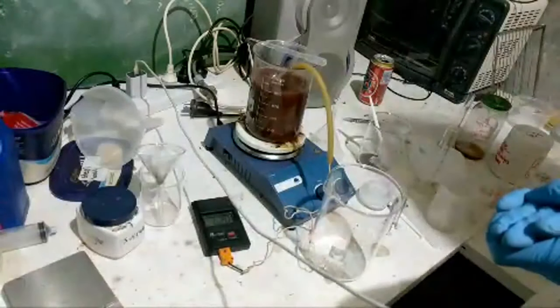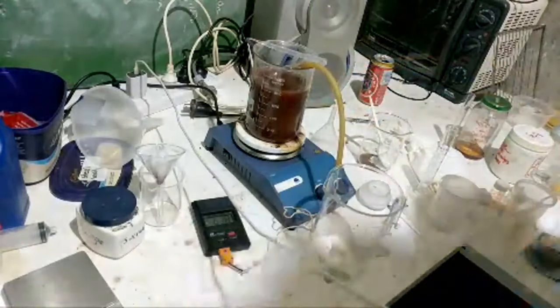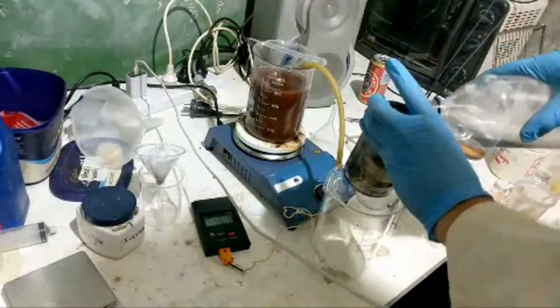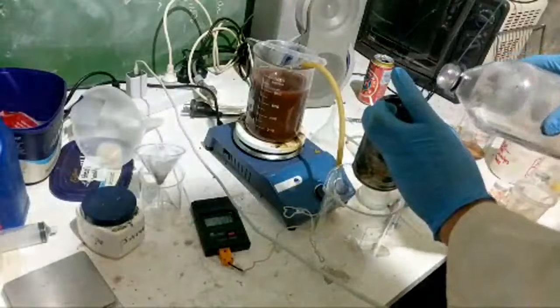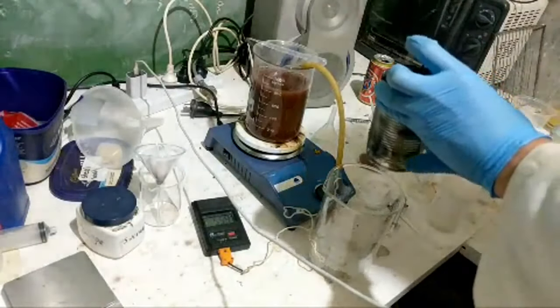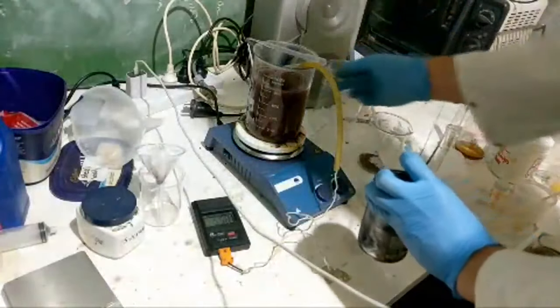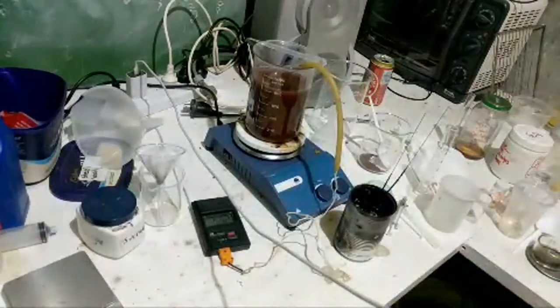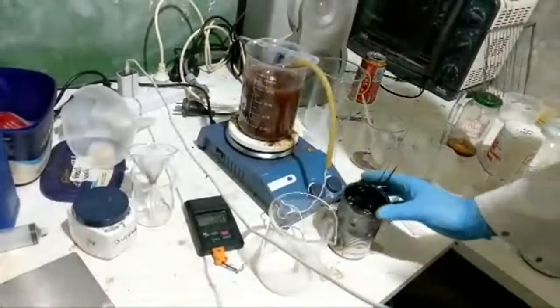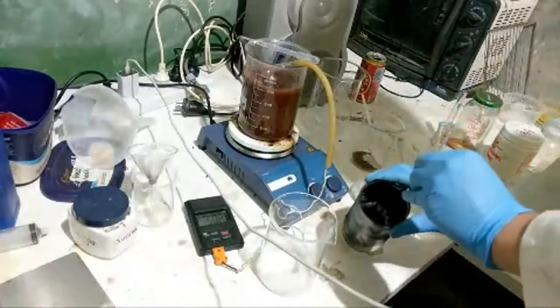Iron oxide, yeah, it's just not soluble enough. Alright, we'll let that cool down. I think we'll give up on that. This is very hot still. We want to cool this down a bit. So we'll leave this beaker for another attempt here. Yeah, I got to filter off the carbon for sure. We'll get these things out of the way.